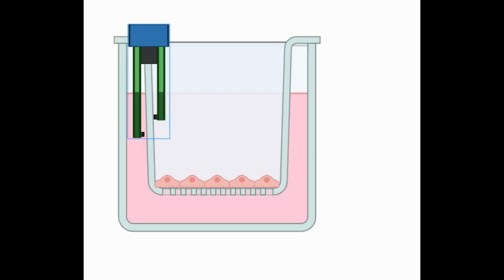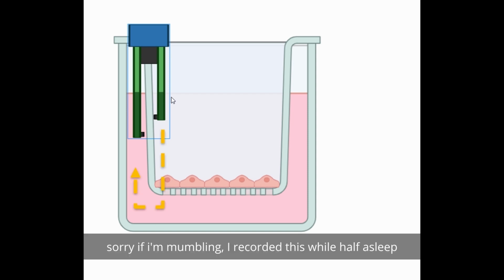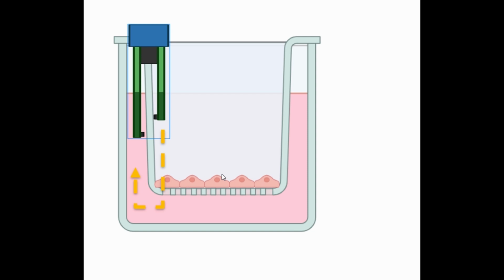Alright, so the way this measurement works is that we stick an electrode into the well plate, and this electrode has 2 probes, and it will pass a current from one probe to the other. And what we measure here is how much of this electrical current or electrical signal is blocked by the cellular layer. The tighter the cellular layer is, the more resistance there is. Basically it gives us a measurement for how intact that barrier is, which would then translate to giving us an idea of how tight and impermeable it is.